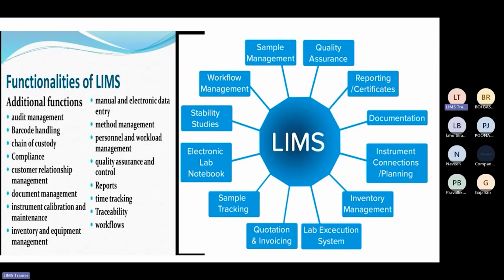Here some other functionalities are explained: sample management, quality assurance, reports, certificates, documentation. All this will be covered in the detailed course. I will explain each and every aspect related to the different functionalities provided by the LIMS software, and that will also be included in the sessions.